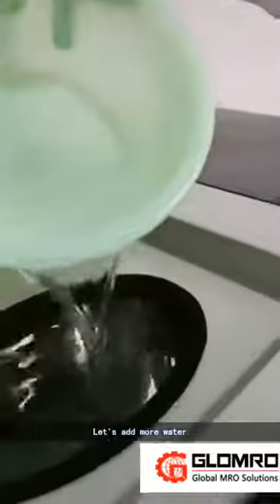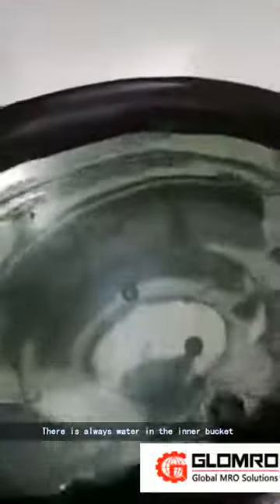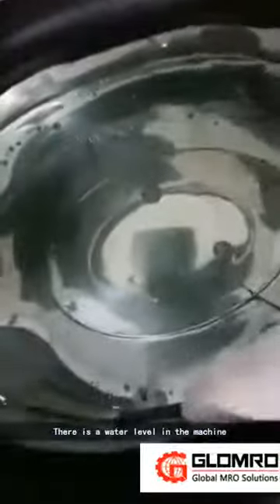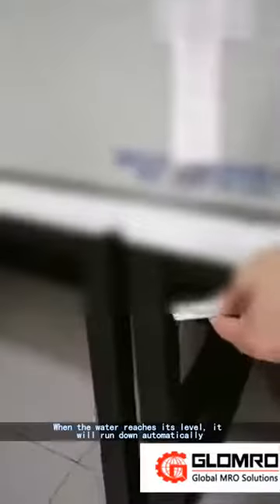Let's add more water. There is always water in the inner bucket. There is a water level in the machine. When the water reaches its level, it will run down automatically. A spillway discharges the water.